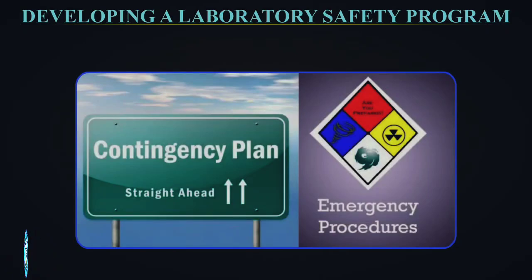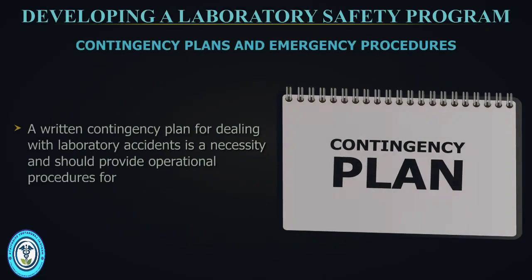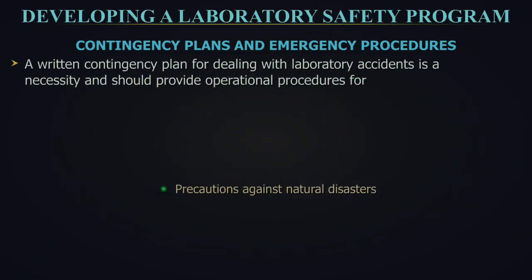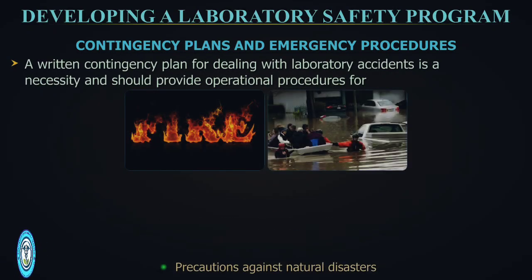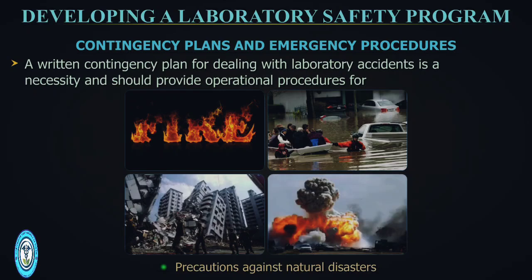Contingency plans and emergency procedures. A written contingency plan for dealing with laboratory accidents is a necessity and should provide operational procedures for precautions against natural disasters, for example, fire, flood, earthquake, and explosions.